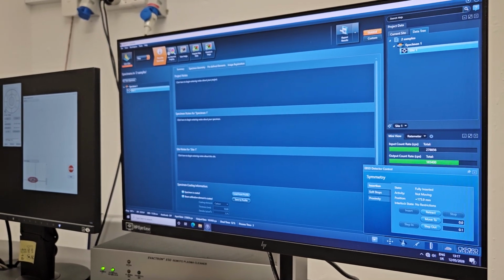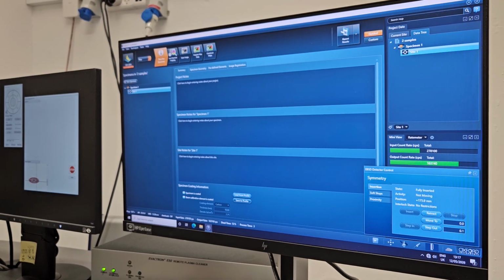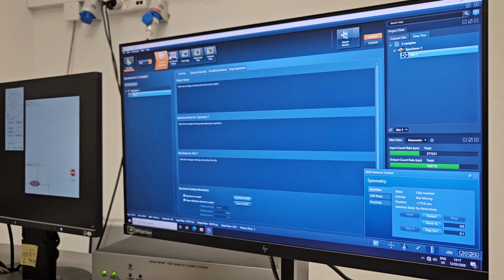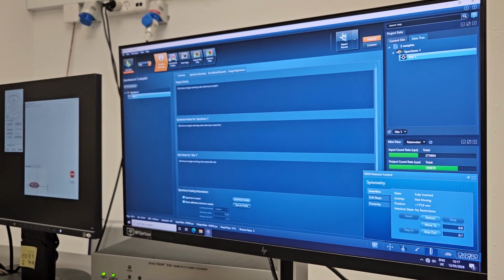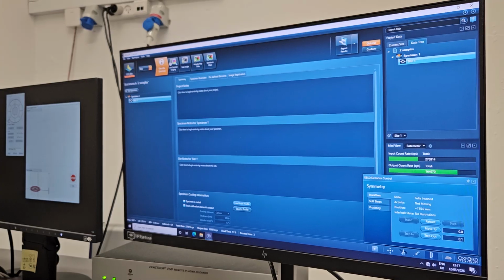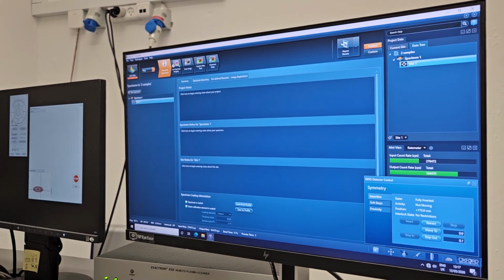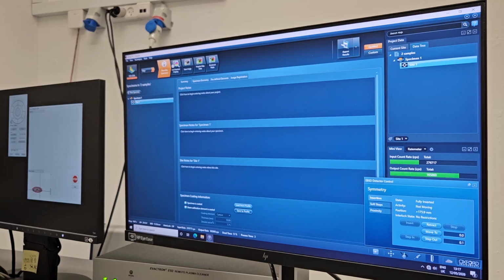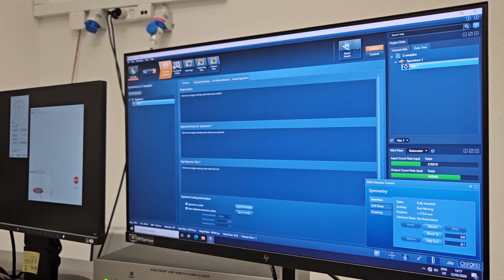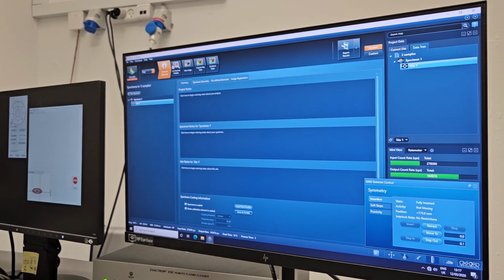There is no service engineer stationed in Denmark, so this service engineer must come either from Germany or Sweden. It's not immediate. Maybe it will take a couple of days before they come. Then they will send it to England. It's Oxford Instruments. It will take time for the detector to arrive, then they will disassemble, prepare, send it back.